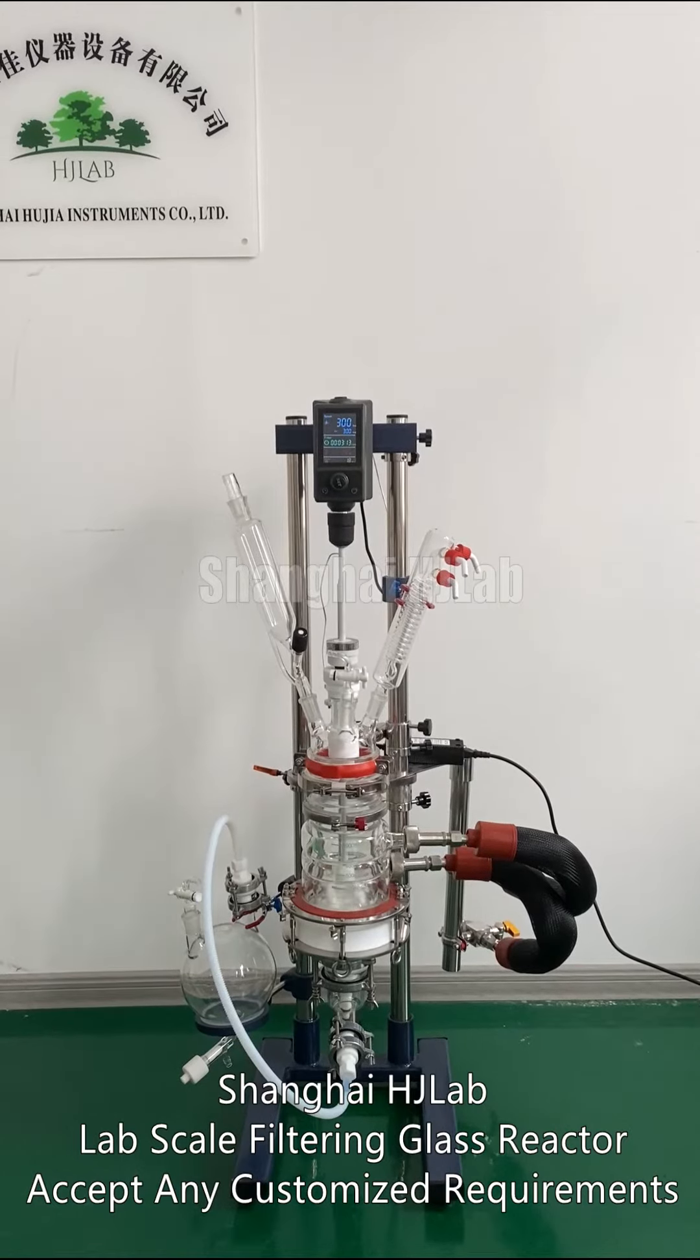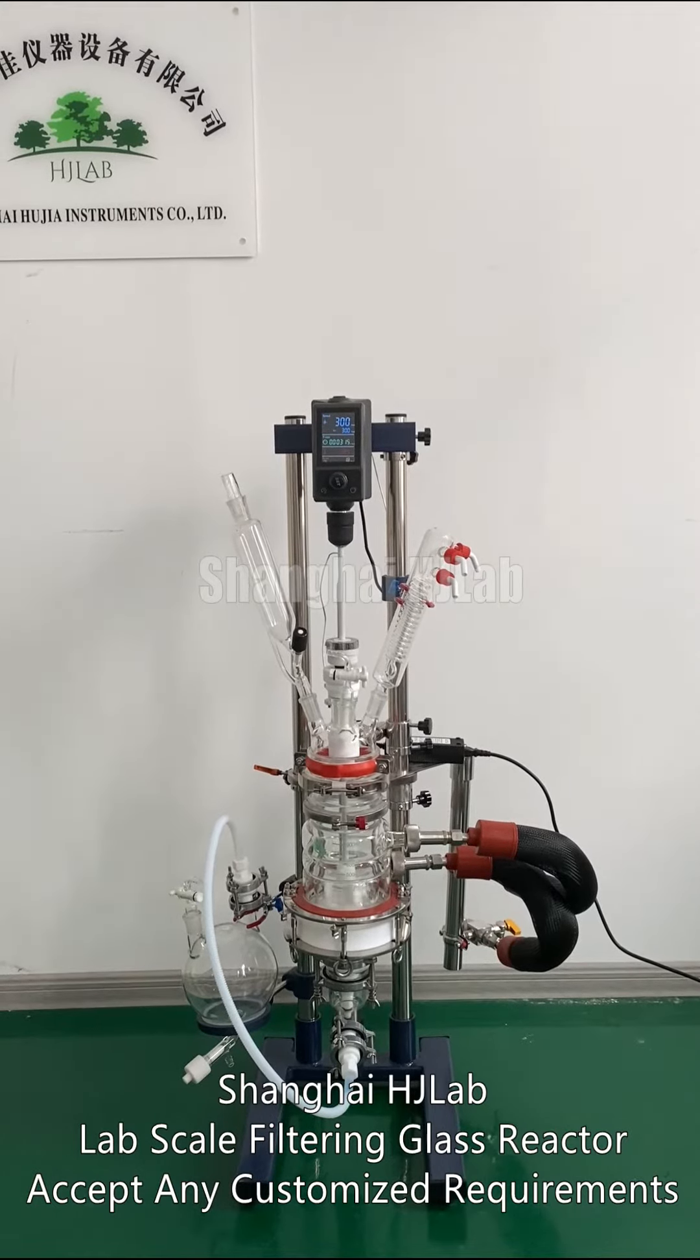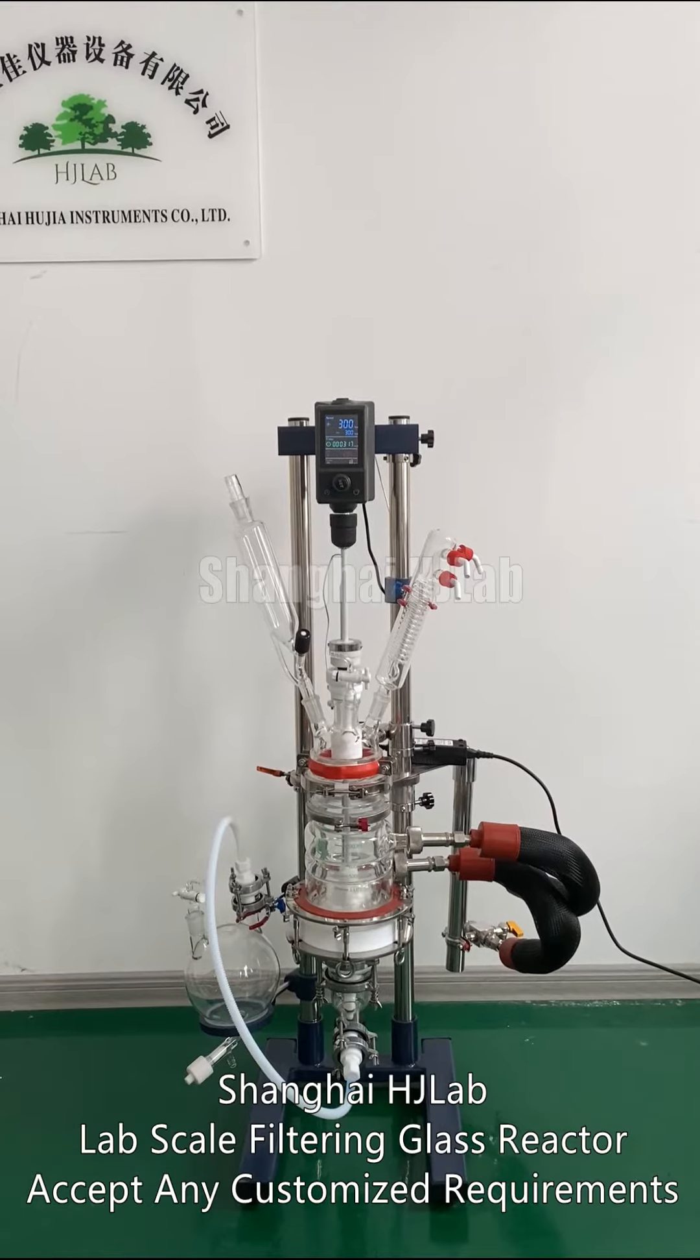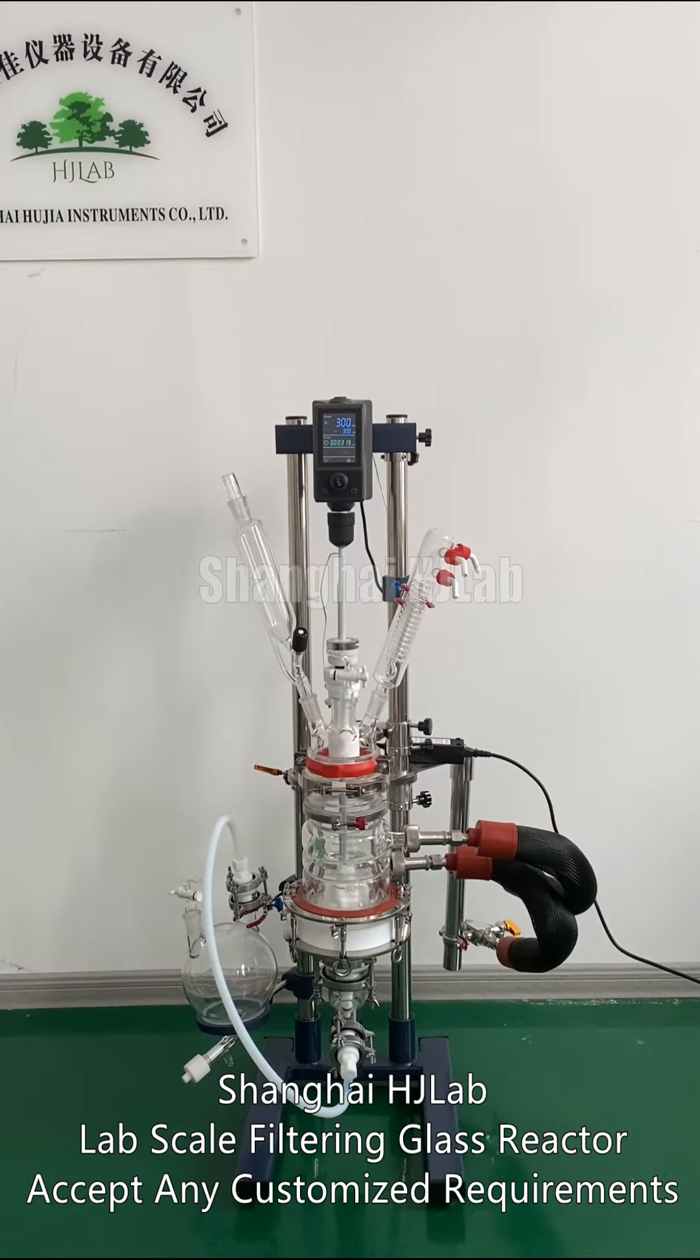Shanghai HG Lab lab scale filtering glass reactor. Accept any customized requirements.